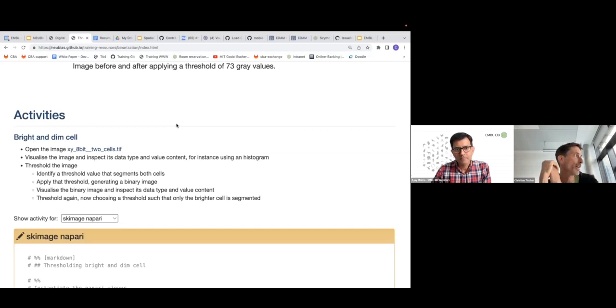The other approach I'm aware of is that people find interesting cells in images or on the microscope, and then there are different ways of getting those specific cells that look interesting in the image out and sequencing them. Basically, you first take an image and then you have some way to mechanically take that cell and do genomic analysis on it. So these are the two avenues I'm aware of.